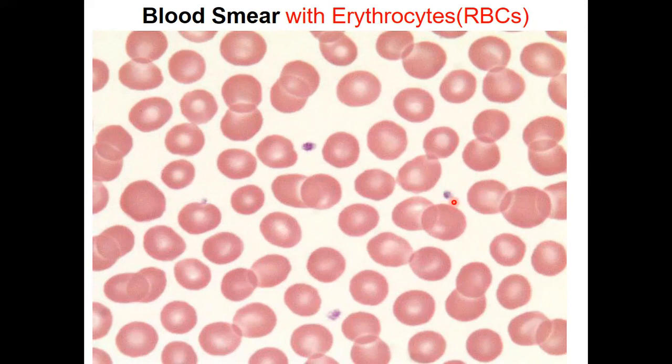Actually, even when you're talking about isotonic, hypertonic, and hypotonic solutions, you consider the concentration of solutes inside the red blood cells. So you need to draw at least 3 or 4 cells. So you can draw this one, 1, 2, 3, 4. Make sure that they are drawn like that and label them as such. So these are red blood cells, with some islands of platelets. That's a platelet, that's a platelet, that's a platelet. But at this stage, only draw the red blood cells.